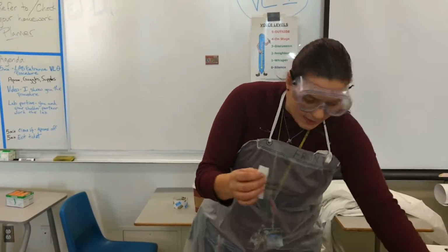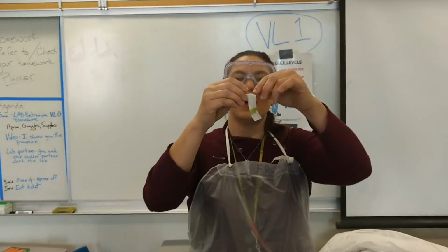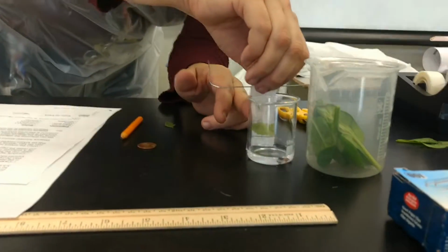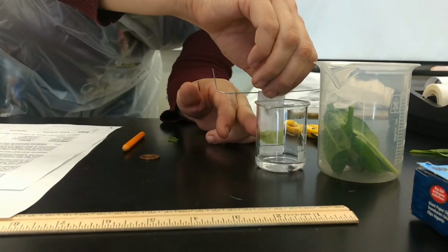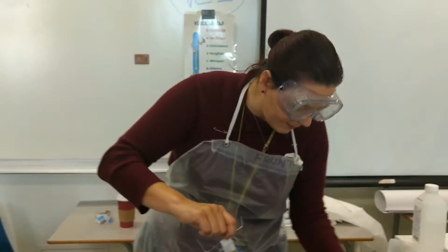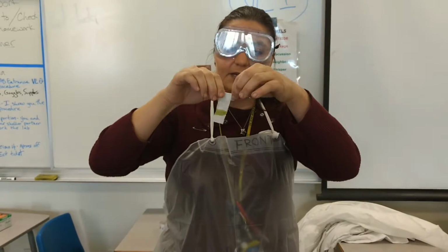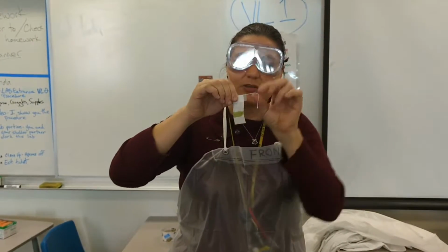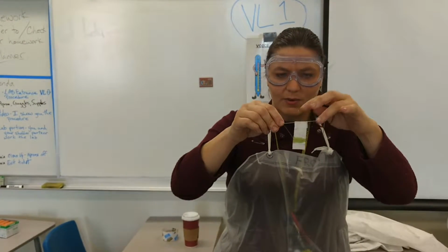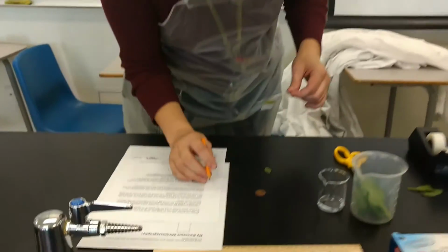So I'm going to go ahead. Now what I need is this right here. I'm going to fold over until I know that when I fold it, the pigment is going to stay, or that line is going to be above the liquid line. So I'm going to fold it over, grab a piece of tape, a very small piece of tape, because if you have it too big, it's going to affect in a negative way your experiment. So let's make sure we have a small piece of tape. Get that piece of tape on there because we want to keep it so it's not going into the solution. All right, tape the filter, okay?